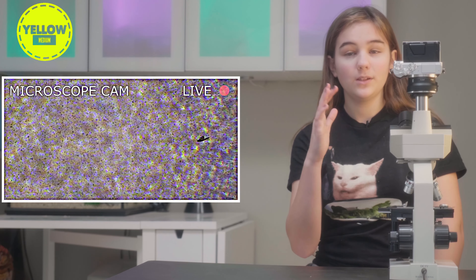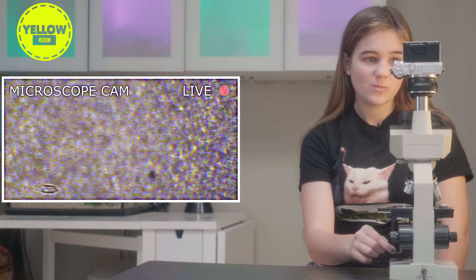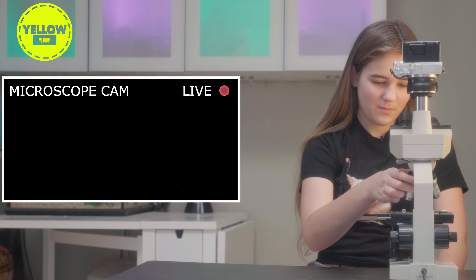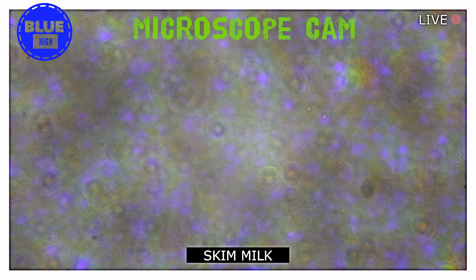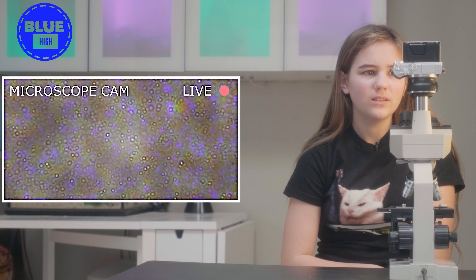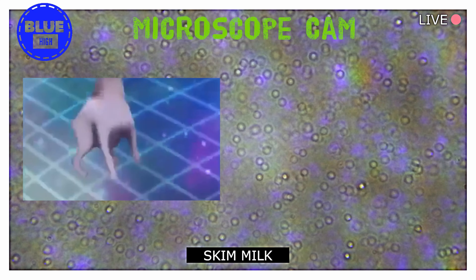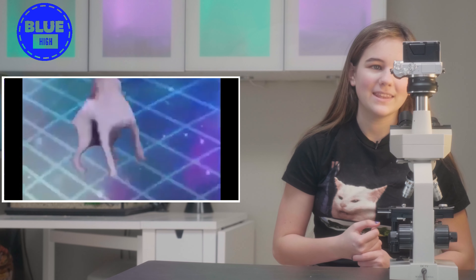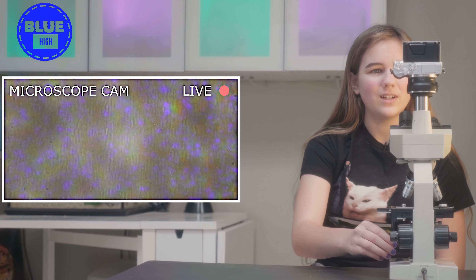The microscope has been cleaned and so has the slide and the sensor. So this is 100% what the milk looks like. I really want to see what this looks like in blue, so I'm going to lower the platform and go to blue. It looks very speckled. There are a lot of little tiny balls and it's moving because I touched it by accident, or just because it's a liquid. That is gross. They're doing the atomic dance — that's what my science teacher made us do to show how particles move. He made us dance all around the classroom. They look like they're doing that dance. They're very clumpy and it looks like a bunch of little eyeballs, so I don't like it.